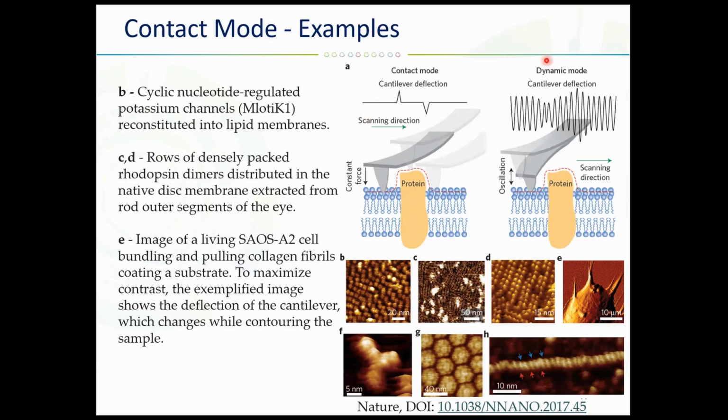So here, this is the comparison of the dynamic mode and contact mode. We will talk about dynamic modes a bit later, but this is just as an introduction and the comparison between dynamic and contact mode.